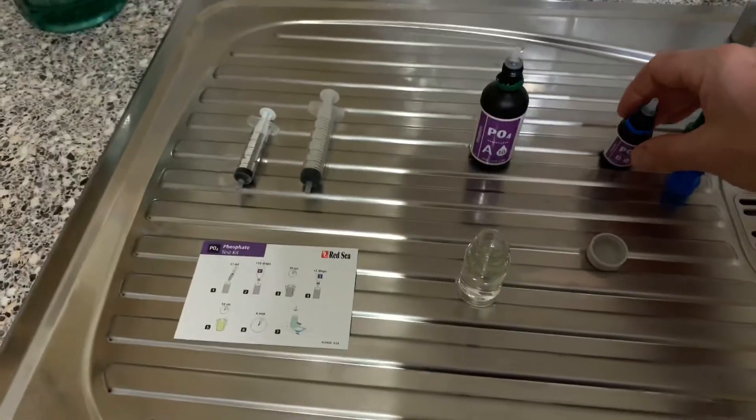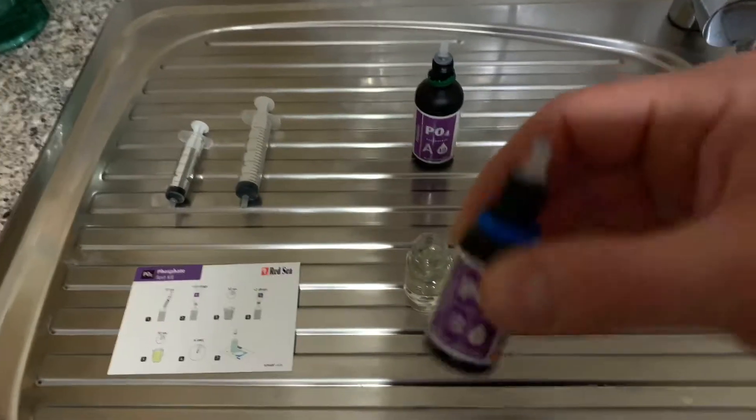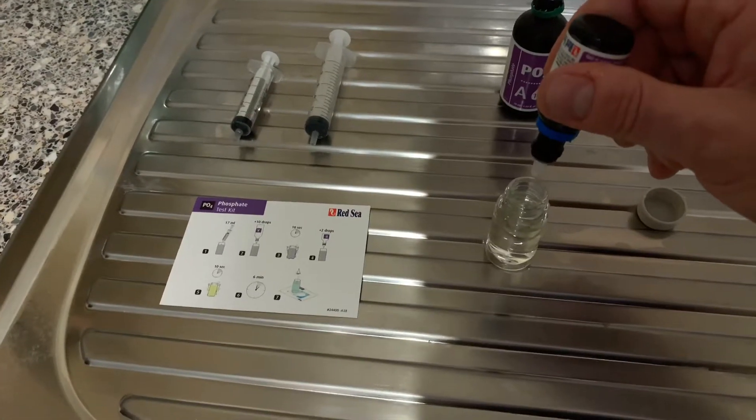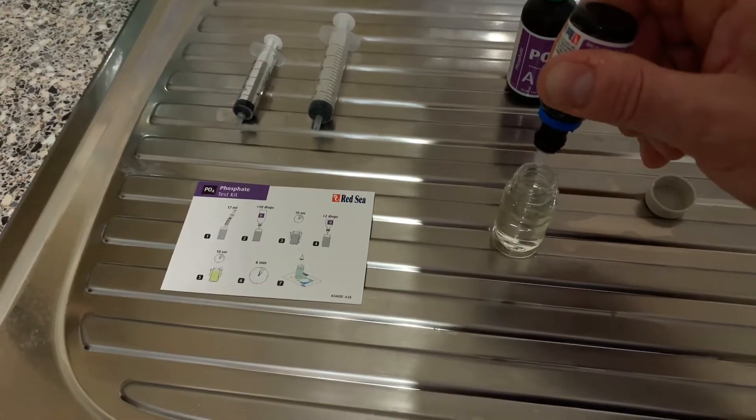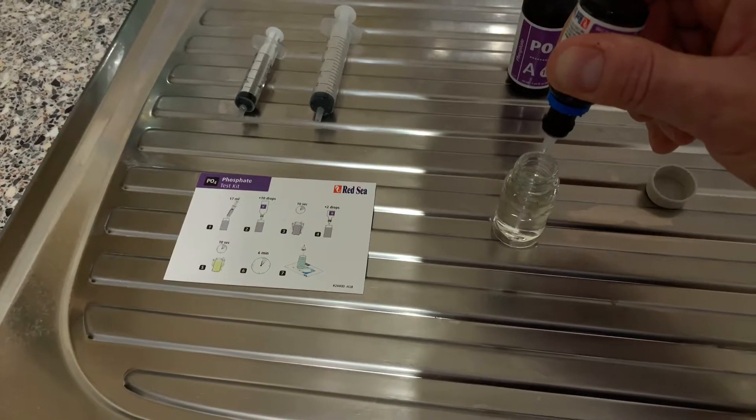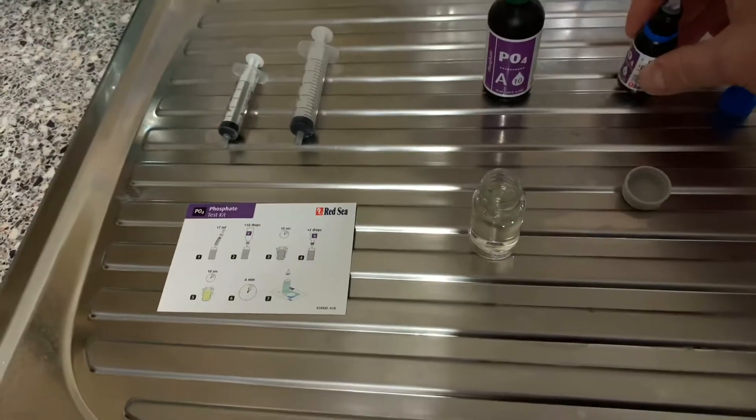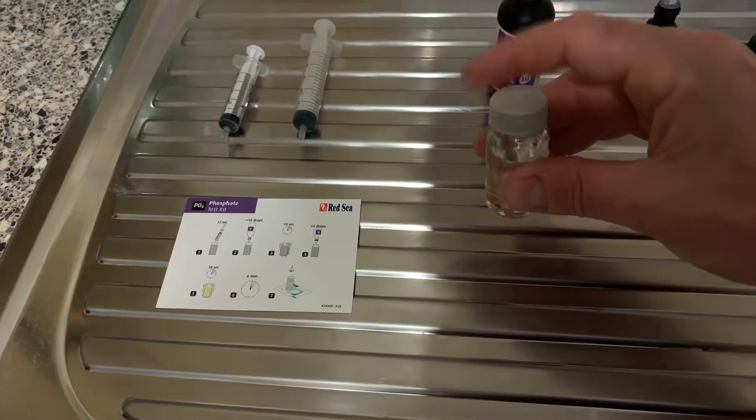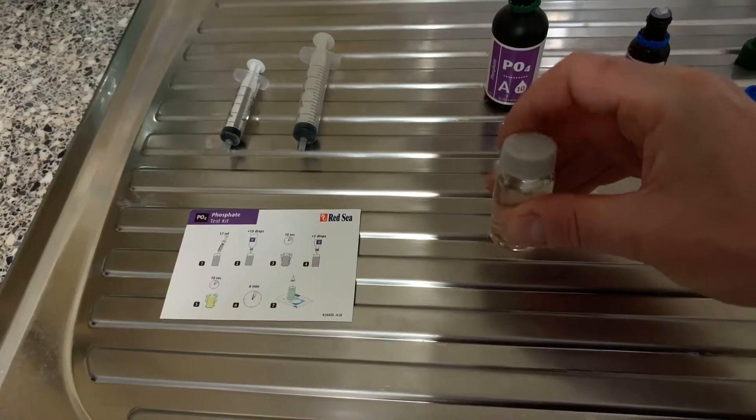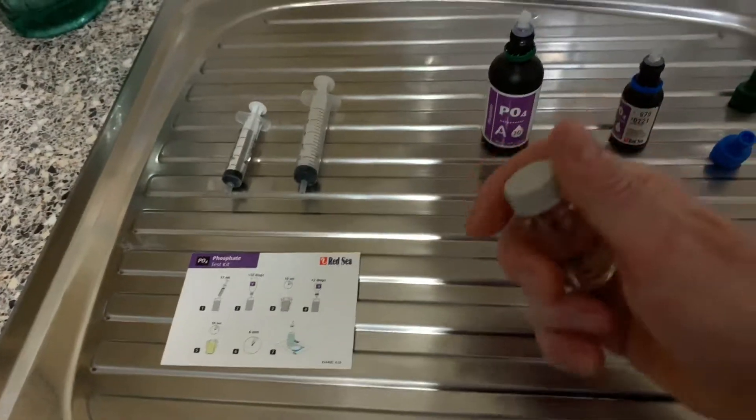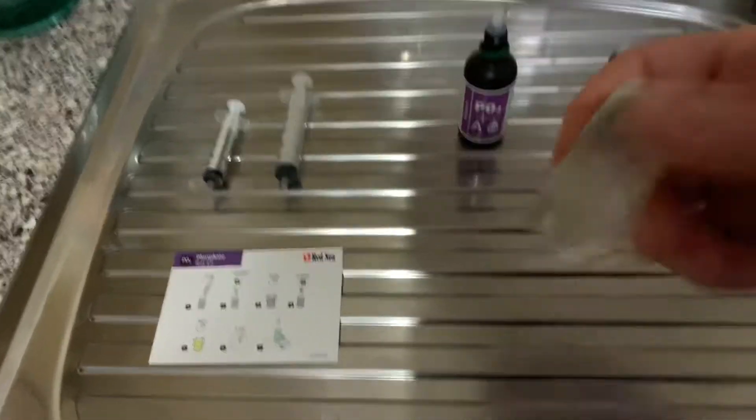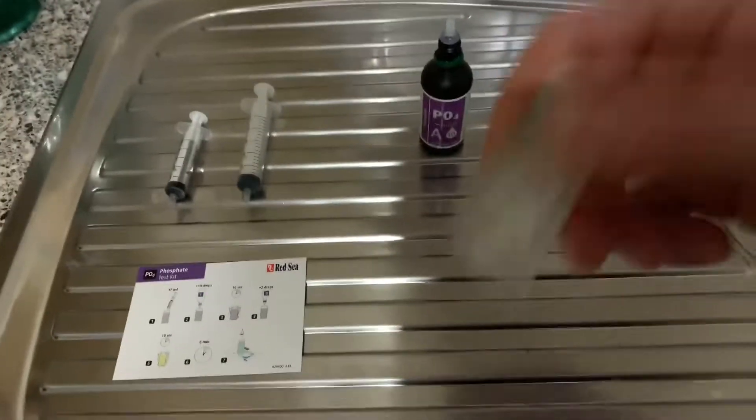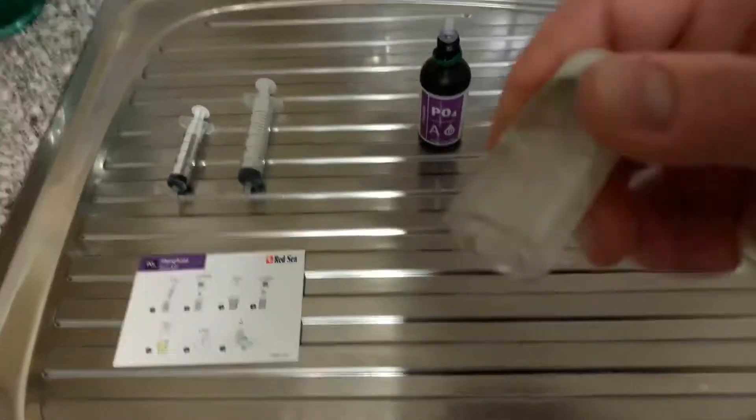Then we'll add 2 drops of Reagent B and get that in there. 1, 2. Then we'll give that a shake for 10 seconds. 6, 7, 8, 9, 10.